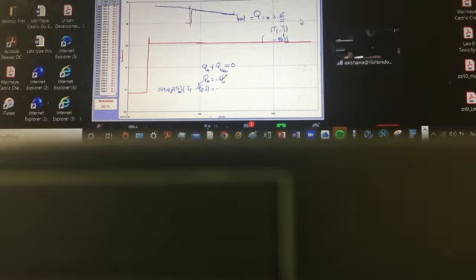Now, every Q term, every heat measurement, has the set of three terms: mass, specific heat, delta T. Now we're going to concern all these measurements with the water measurements. What's the mass of the water? So the first term for the water, 74.5. Right, so I'm going to write down 74.54 grams.